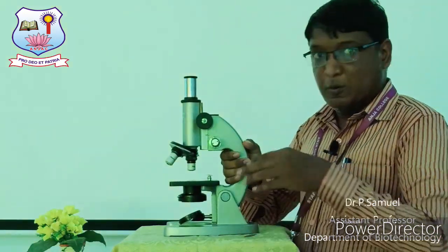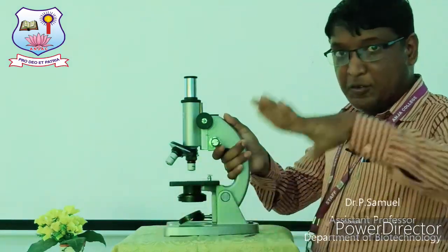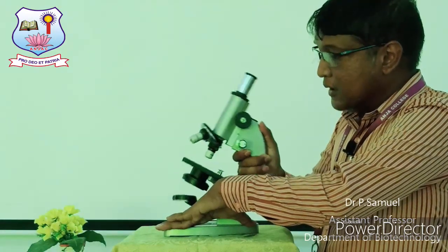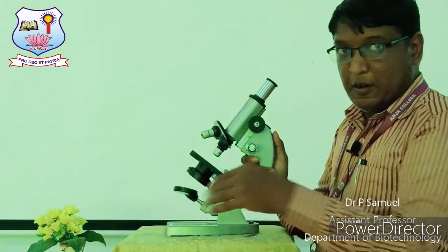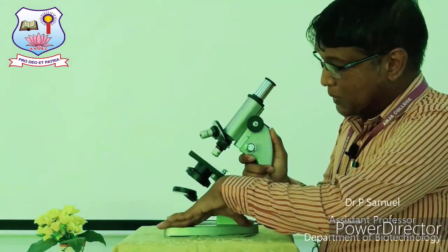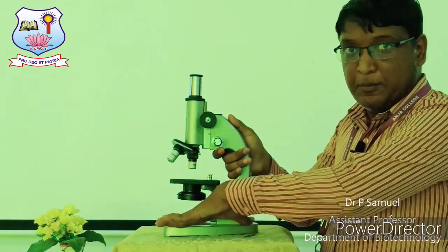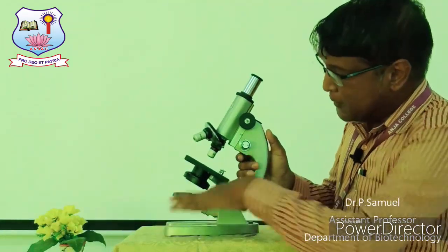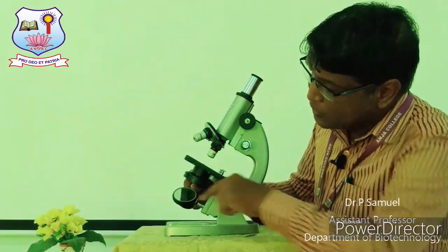And now we are going into detail. This is the way, right? Use your left hand, press here and uplift the portion, right? Watch me very closely. Use your left hand, press at the base of the microscope, lift it gently, and this portion is called the mirror.